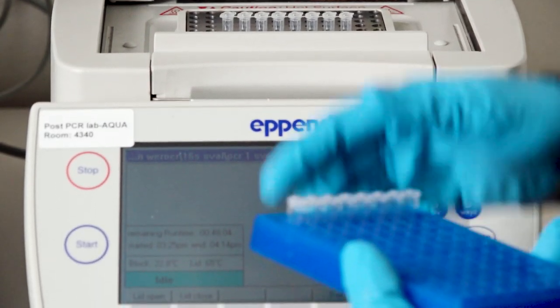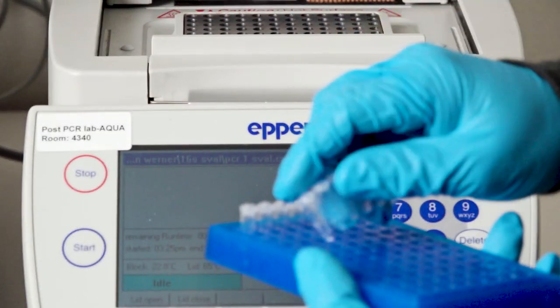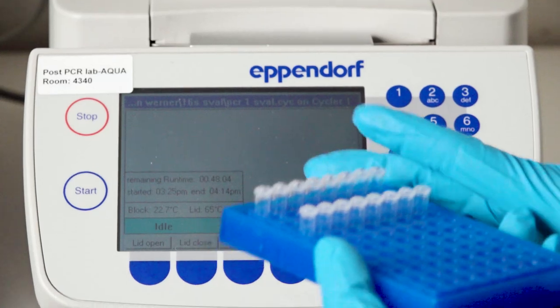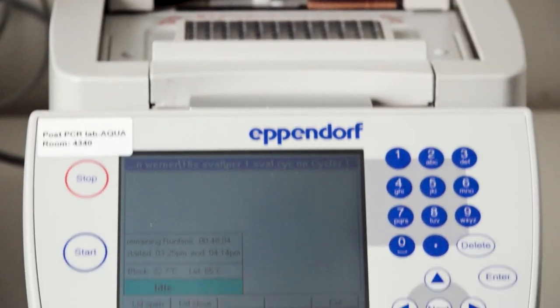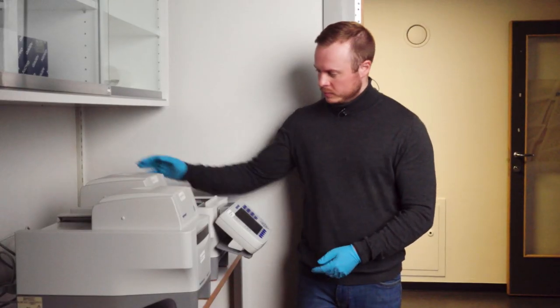You take out your samples and be careful—they can be quite hot, so you can try to avoid touching the plate. Then we put the samples back on the table.